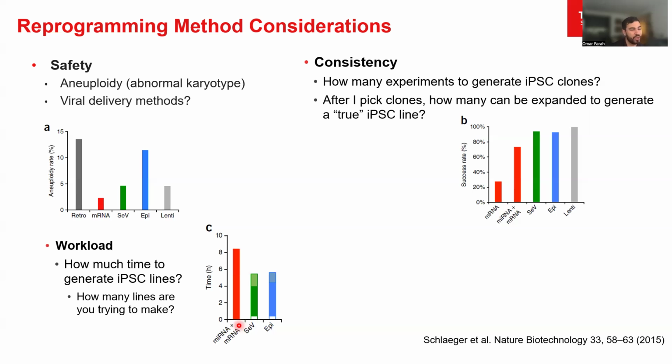But this is really, really important, specifically if you're working with multiple cell lines, right? If you're doing a bigger project where you're creating some sort of bank, right, and you're collecting a lot of patient samples and reprogramming them into induced pluripotent stem cells, do you prefer a method that is potentially a little bit safer but can take a lot more time, or something like the Sendai, for example, that is relatively safe but has a shorter handling time, but also maybe associated with a viral component that's not very desirable, right?